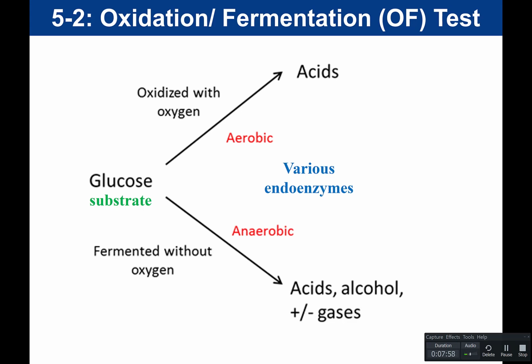That means that the bacteria is going to oxidize the glucose. In the case of fermentation, fermentation is without oxygen. So without O2, bacteria would do fermentation. That is an anaerobic process, right? Anaerobic means without oxygen.